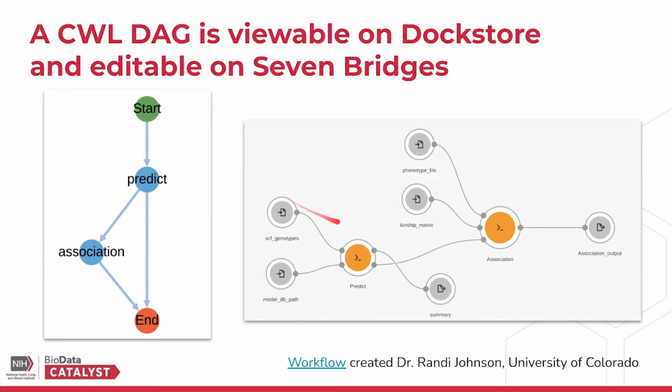The difference here, so this is viewable for any CWL workflow on Dockstore. After you import it, you'll be able to see this view of the workflow and actually use a WYSIWYG editor called Web Composer to edit the workflow, make your changes, and then at the end of your project, if it was significantly novel enough and you want to share it, especially if you used it for publishing, you could push it back to Dockstore and do everything Ash just described.